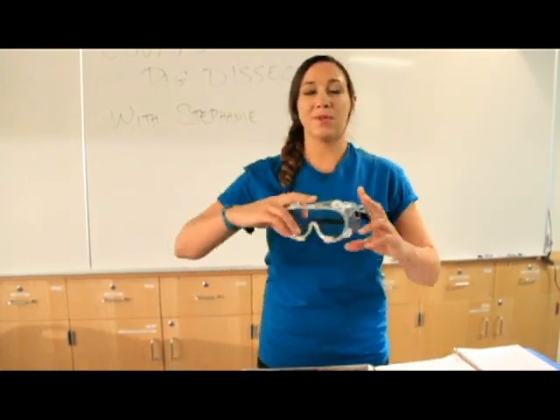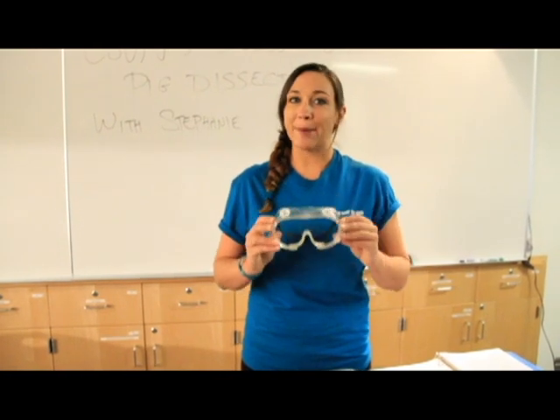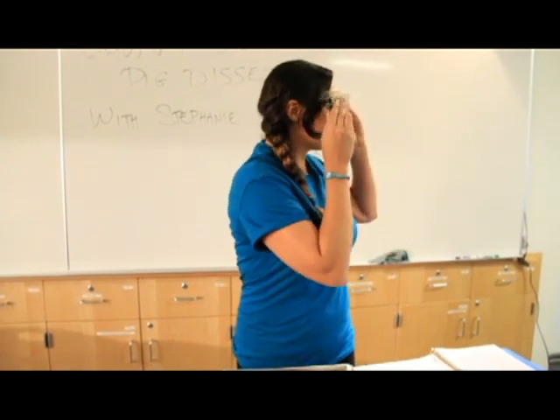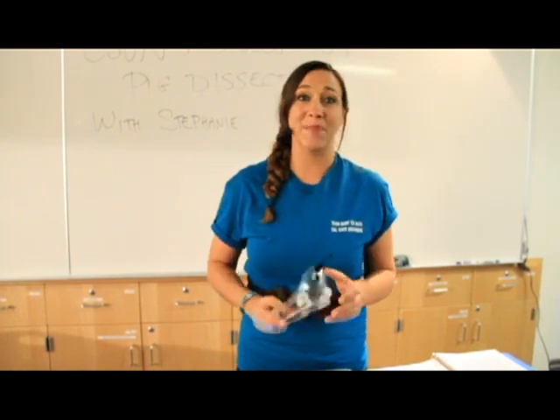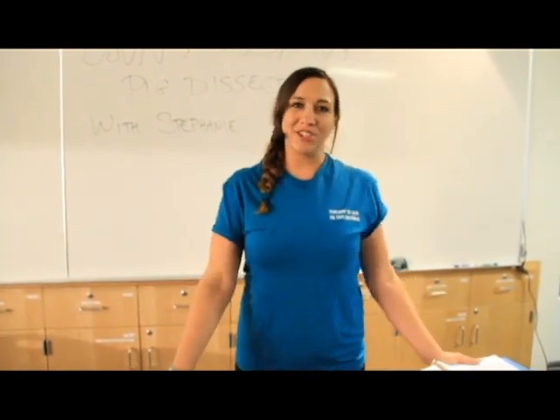And also, last but not least, your goggles. Goggles are absolutely necessary. You won't be able to do the dissection if you don't have your goggles. They must be the ones that completely cover your eyes, so none of those ones with the sticks. You actually need the full eye covered goggles. Like I said, they are mandatory. So with that, let's get started.